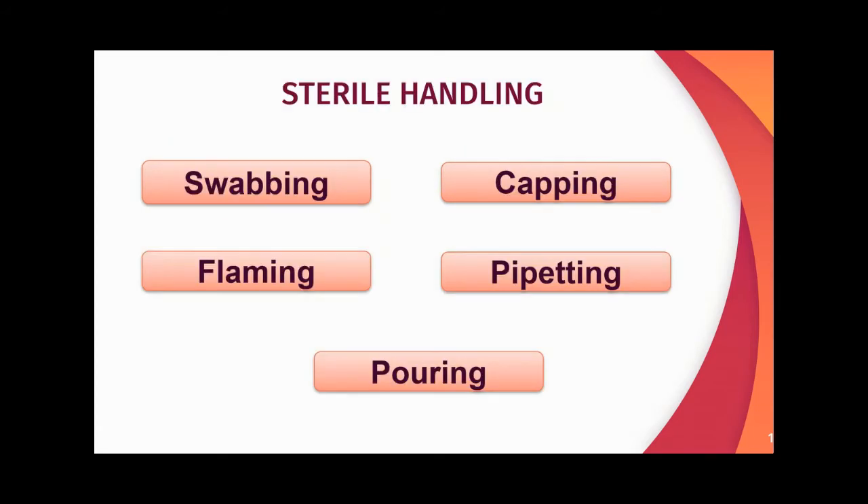What are the safety precautions we should take during sterile handling? They are: swabbing, capping, flaming, pipetting, and pouring. Let us see each individually.